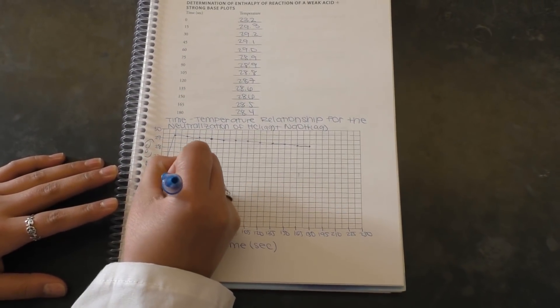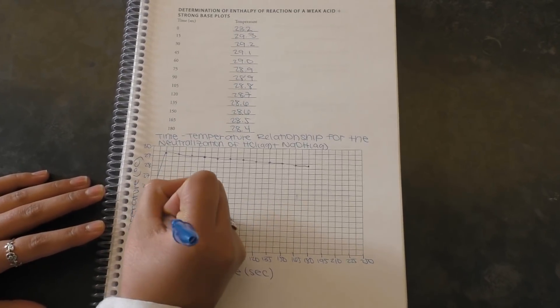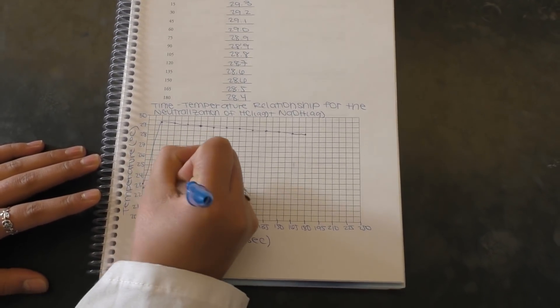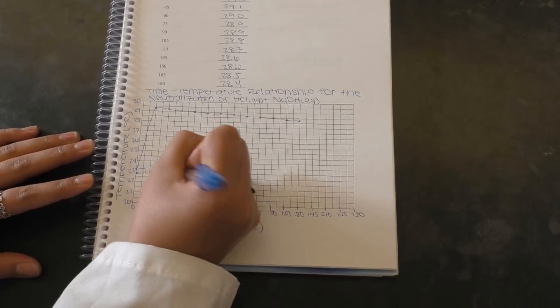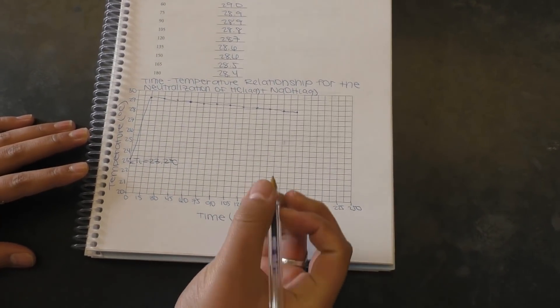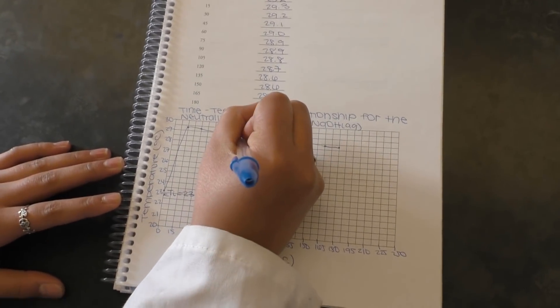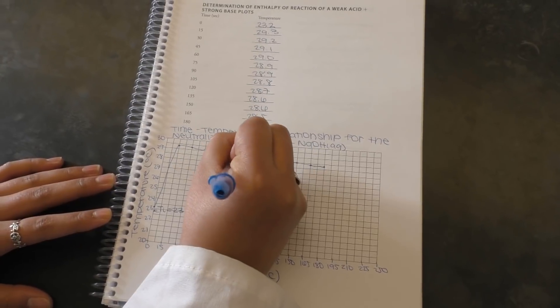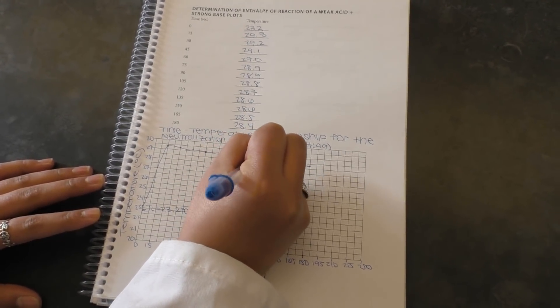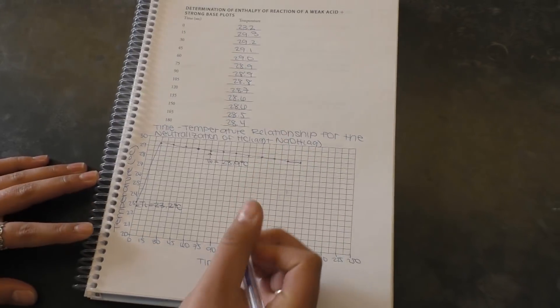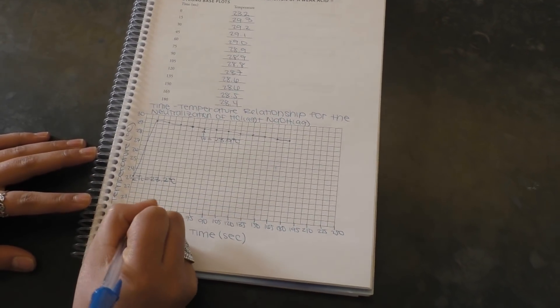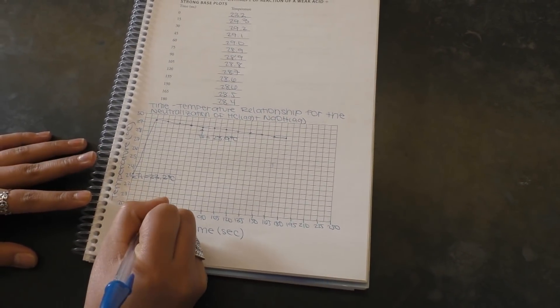Now be sure to label the initial and final temperatures of your calorimeter's contents, TI and TF. TI is the temperature of your solution in your calorimeter before you added anything to it. TF is the temperature at which your data plateaus. And finally, you must also label your change in temperature, or delta T. This is just the difference between your final and initial temperatures.